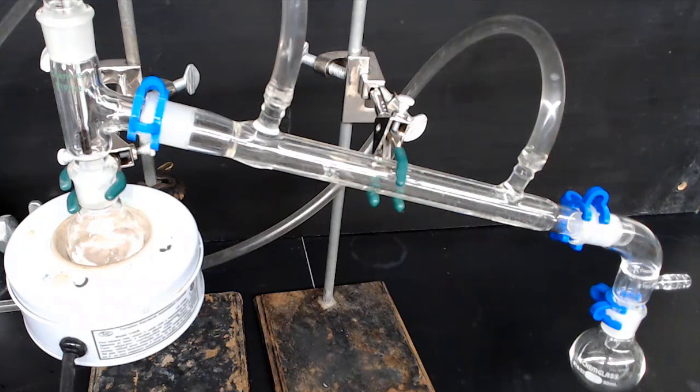As the flask heats up, you'll notice the liquid boil. Once it begins boiling, the vapor in the apparatus will climb up until it eventually touches the thermometer bulb. Then you'll notice a temperature rise on the thermometer.